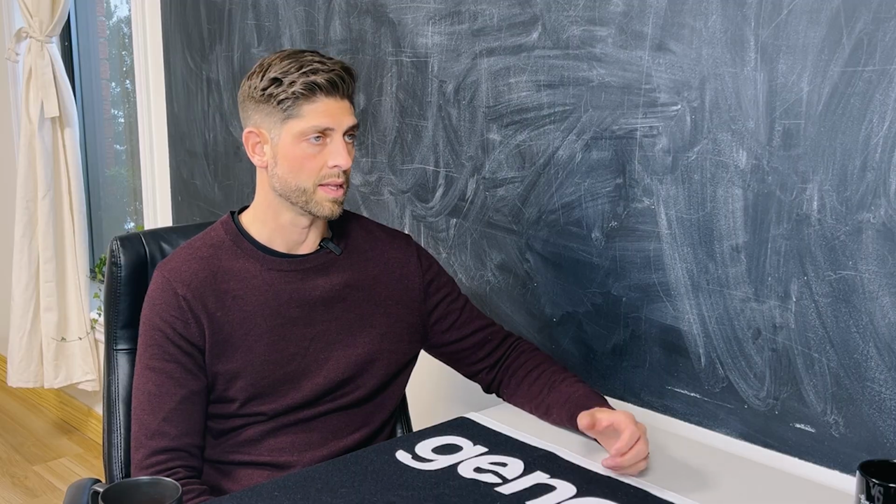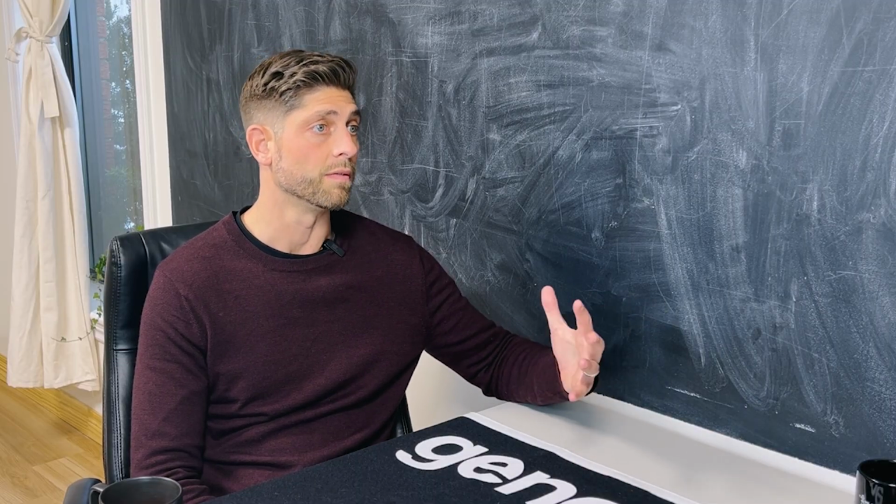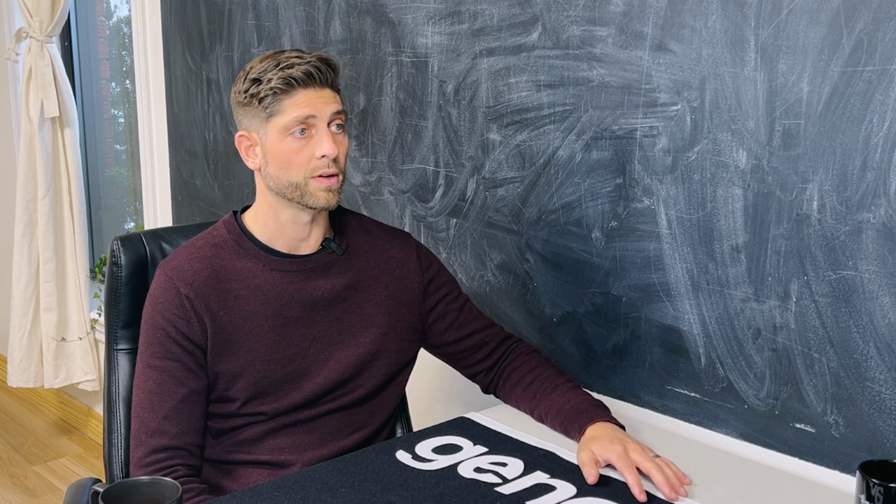And so what we'll do to mitigate that is we will heat the solution back up, we'll remove a little bit more solvent, and then we'll do the crystallization again. Okay, so the ability to redissolve that solution and start over is critical then. Yeah, exactly. If you try and take that solution all the way to the point where you're filtering it, it's a huge waste of time essentially. So having the ability to instantly switch it back to heating mode, pull off a little bit of solvent to resaturate, and then switch it back to cooling mode to do your crystallization again allows you the maneuverability to adjust your solvent ratio, or your dilution amount.